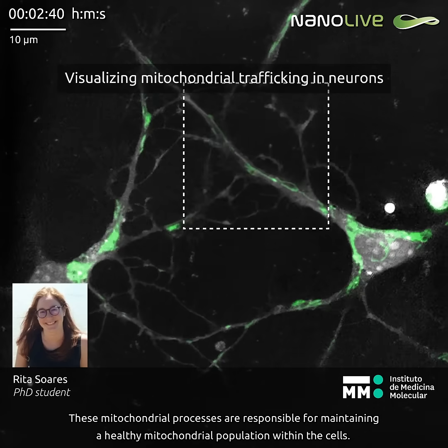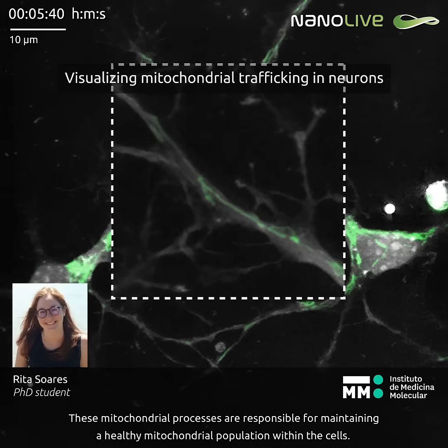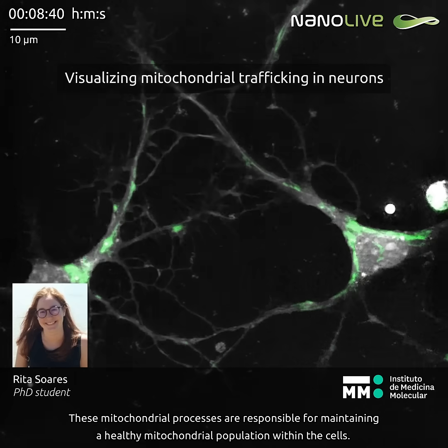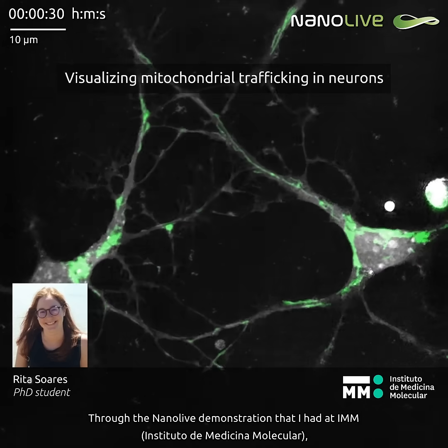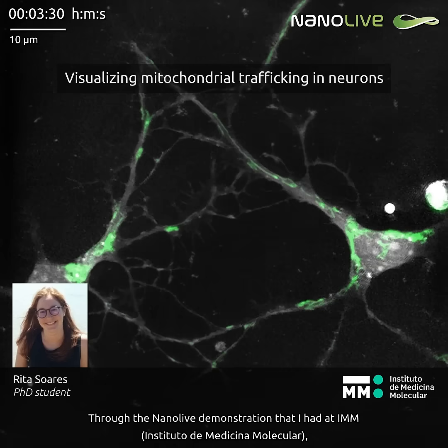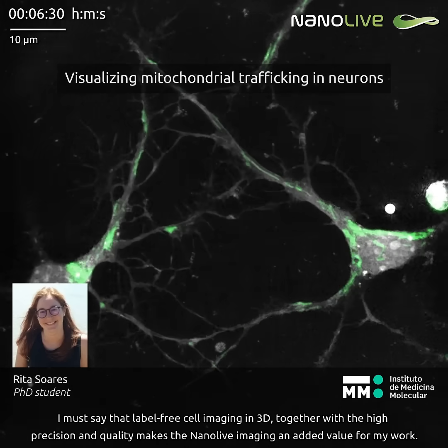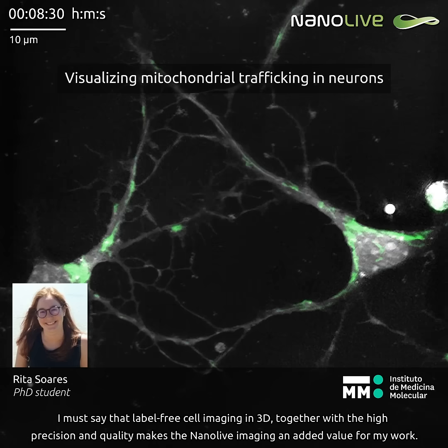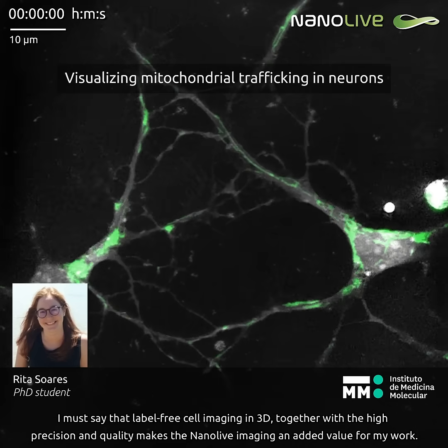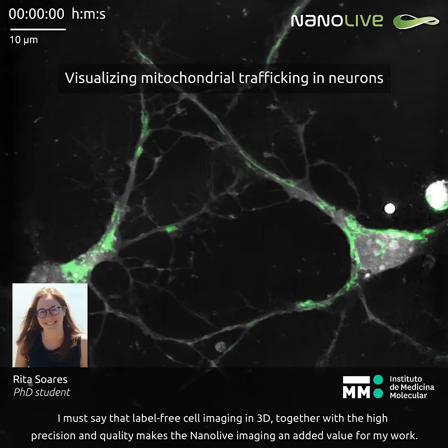These mitochondrial processes are responsible for maintaining a healthy mitochondrial population within the cells. Through the Nanolive demonstration that I had at IMM, I must say that the label-free cell imaging in 3D, together with a higher precision and quality, makes the Nanolive imaging an added value for my work.